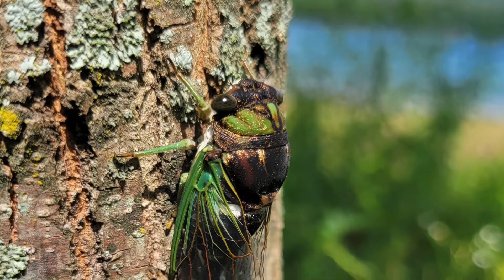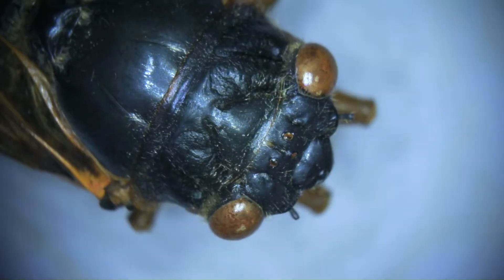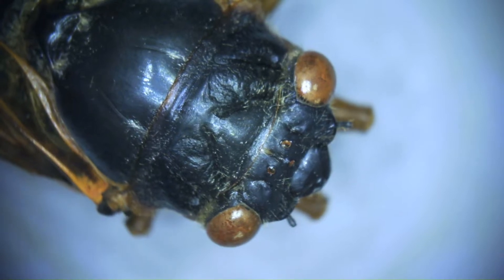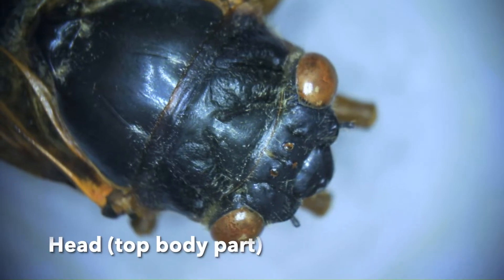Here we have the annual cicada, which are these green cicadas, but we'll be focusing for this on our Brood X cicada, or a periodical cicada. I got one of these found dead, likely from parasites.